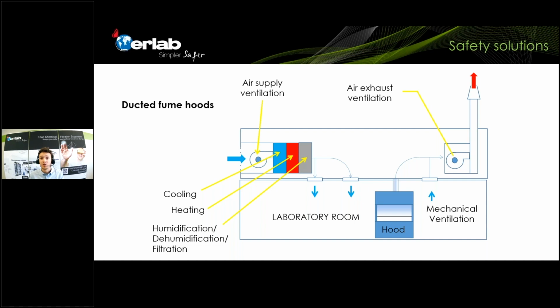So that's also important to take into account. And it's also an awareness that people need to have when choosing the adapted safety equipment. Of course, the risk in the lab is not completely gone when you use ducted fume hoods. You will exhaust the air to the outside, but then you have to pull clean air back into the laboratory through an HVAC system, and that air will be heated again or cooled again, which will result as well in a high energy cost.